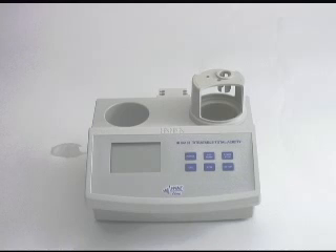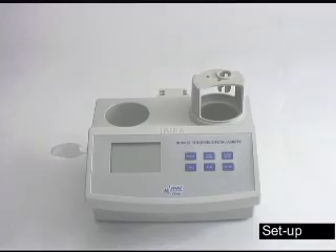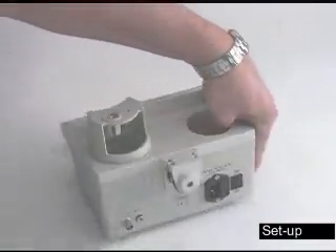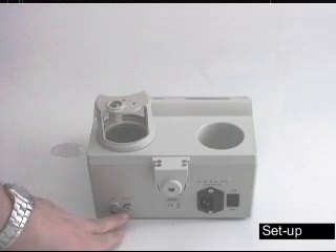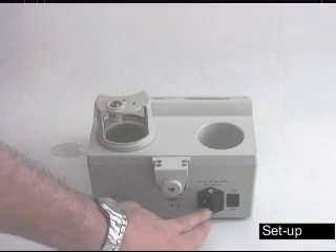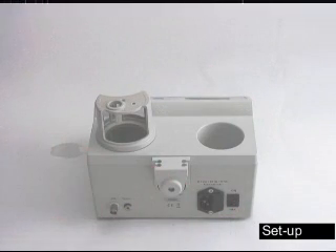Once you've unpacked your unit, the first thing we're going to do is hook up the probes and tubing set before we start the titrator. In the back of the titrator, we'll have the pH and temperature probes hooked up here, power cord here, and the on-off switch on this side.